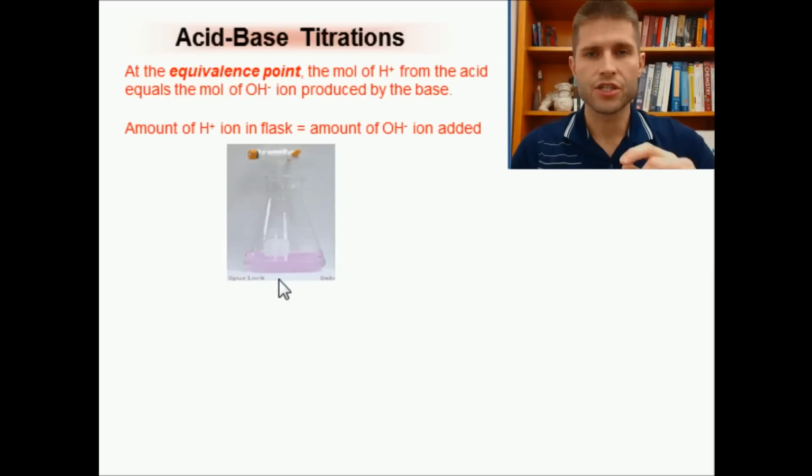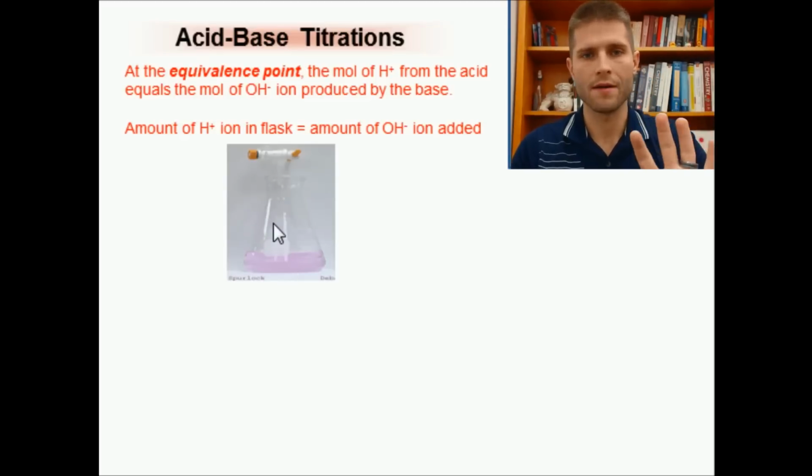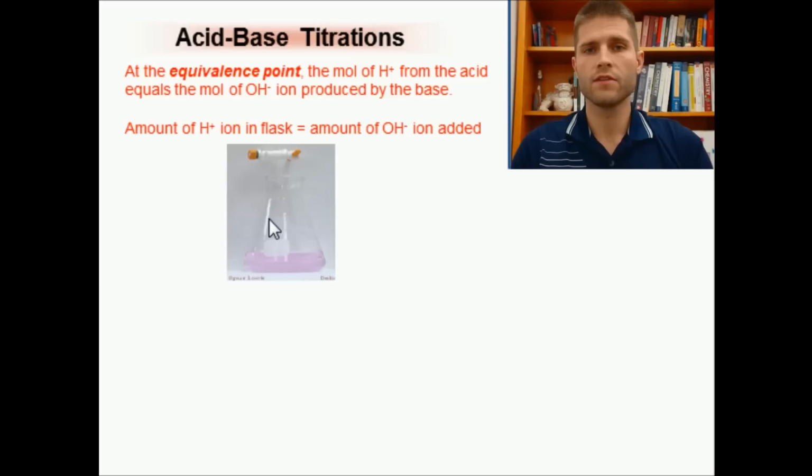Here, you'll start seeing pink colors form a little bit at a time, but they'll disappear. So you'll add a drop, it'll turn pink, it'll go away. Add a drop, turn pink, go away. You're getting close to the equivalence point when the pink keeps disappearing.